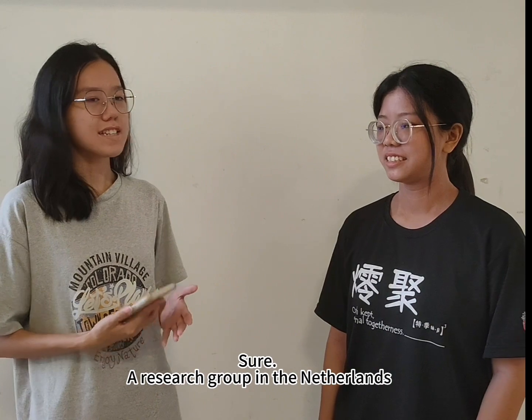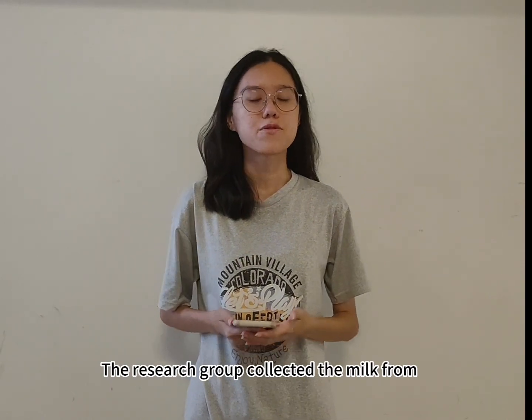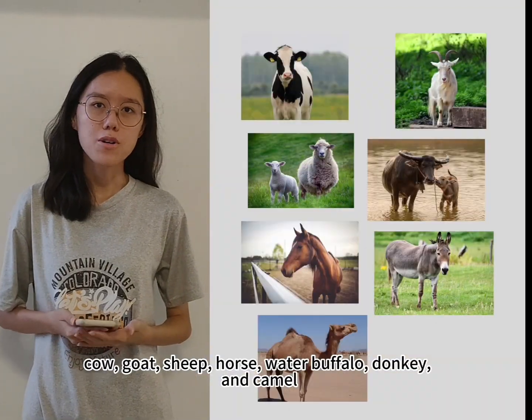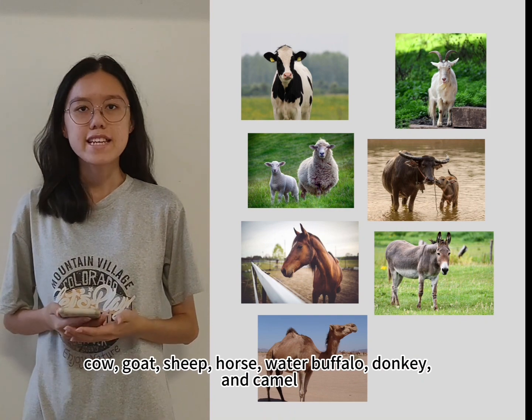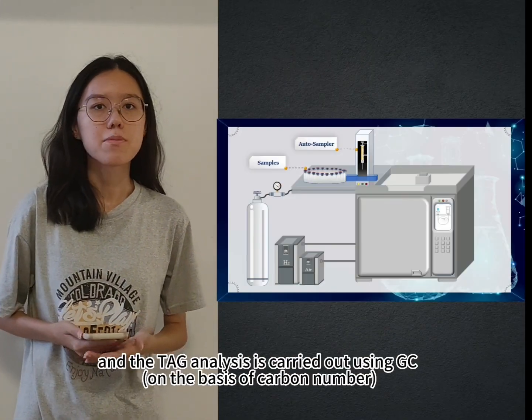Sure. A research group in the Netherlands used GC to differentiate the milk fats from several species. The research group collected milk from cow, goat, sheep, horse, water buffalo, donkey, and camel. The milk fats are first extracted and then the analysis is carried out by using GC.